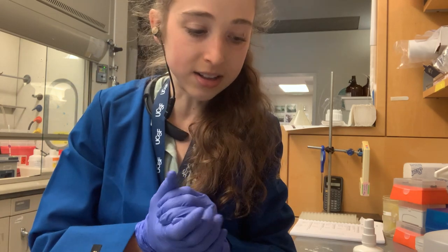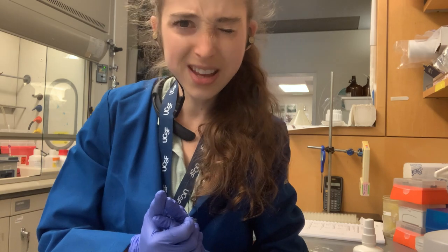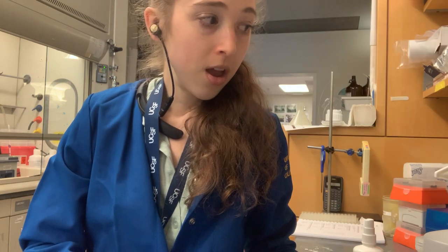If you use color coding, that's also a very helpful thing. And when you get a new chemical bottle or something like that, it's helpful to put the date that you opened it. Now I really think I am done. Bye.